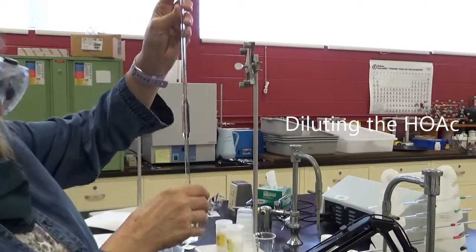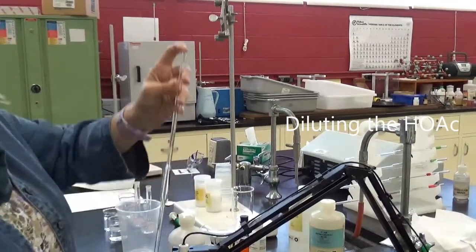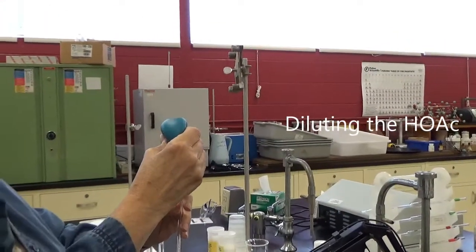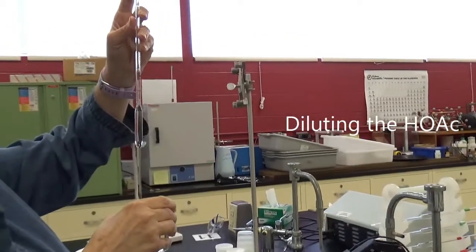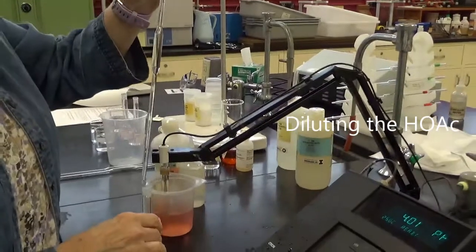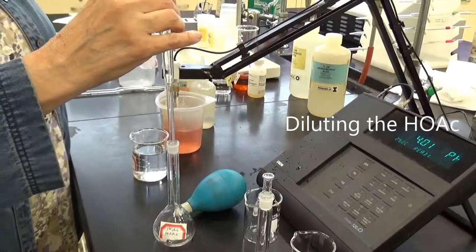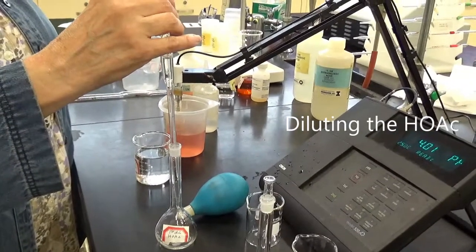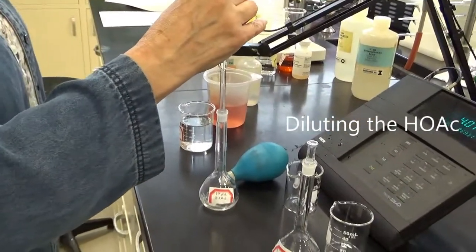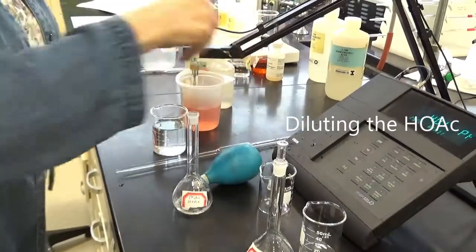This one isn't cooperating too well. I don't like those other devices, but this one can be pretty annoying too. All right, good, that's how it worked. 5 milliliters in here, into a 50 milliliter volumetric, which then I will fill to the mark with water. Okay. Water.